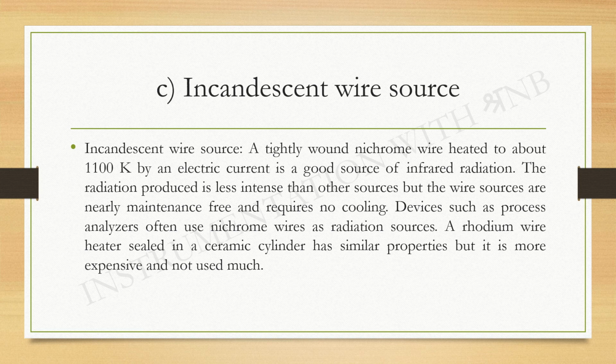And in the globar there is a positive resistance, but we have to cool the rod. There is nothing like that in nichrome wire. It requires no cooling and is maintenance free. Its lifetime is high and it is less expensive. In place of nichrome wire, sometimes rhodium wire is also used, but it is more expensive than nichrome wire.